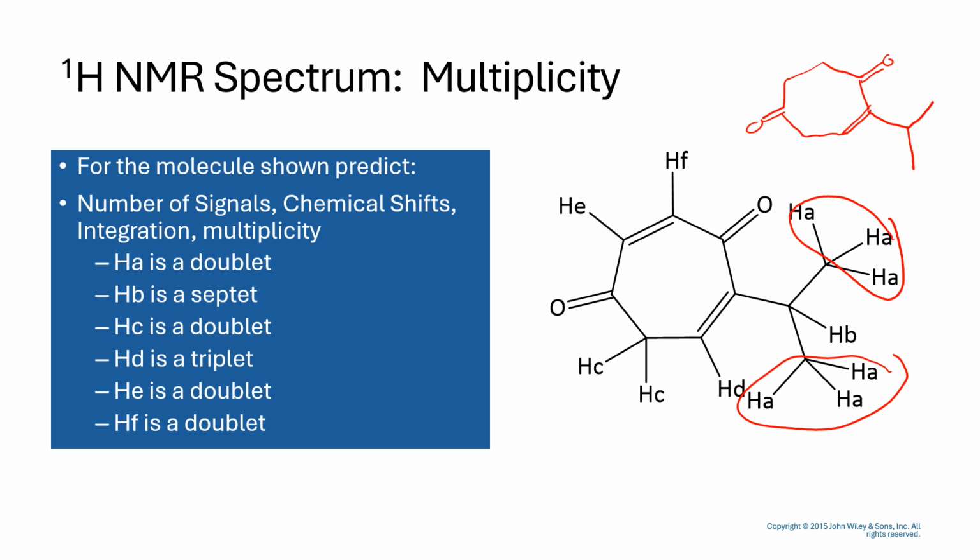That is actually an isopropyl pattern, if you see that here. The isopropyl pattern is when you have protons type A, these are 6 H's, and they have 1 neighbor, so it is a doublet, part of the isopropyl pattern. And B is 1 H, and it has 6 neighbors, so it is a septet. So that is the typical isopropyl pattern.